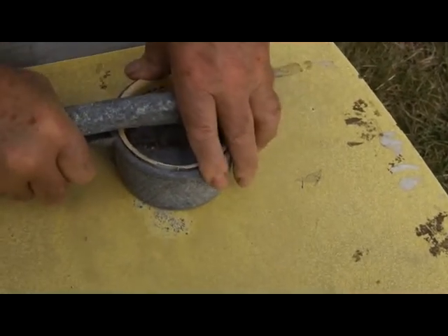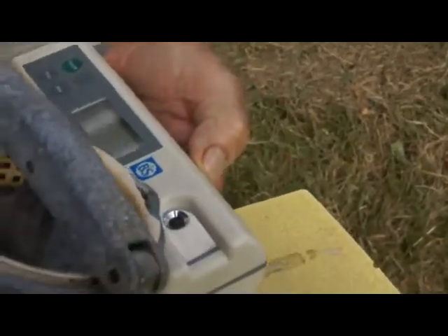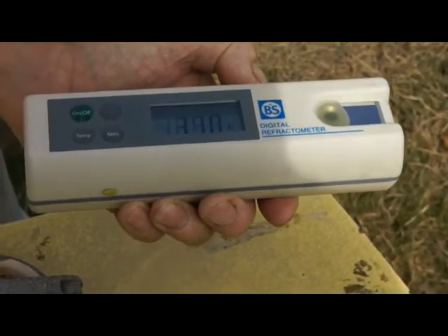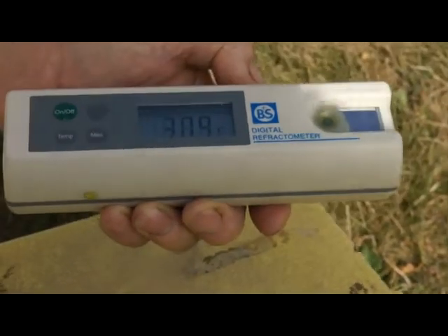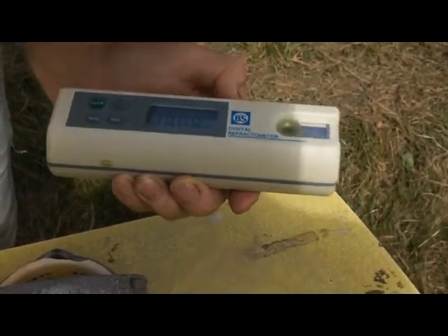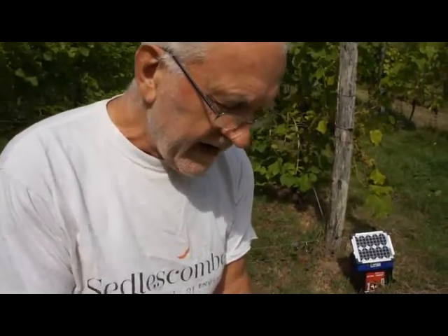There we are, that's pretty much done. The first thing we can do is test the sugar. We put a drop onto this little glass ball there and then press on/off to turn it on. That gives the temperature — it must have been in the sun; it's saying 30 degrees. The air temperature today is about 23 or 24, so maybe we had that in the sun. But anyway, this refractometer does do automatic temperature adjustment, so the temperature shouldn't really affect the accuracy of the reading.